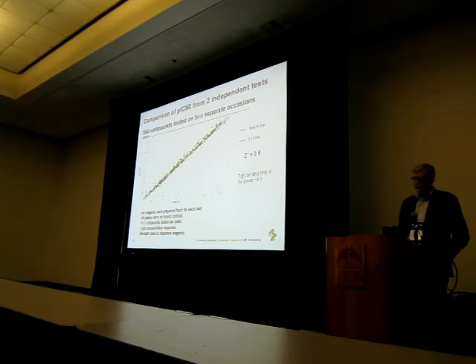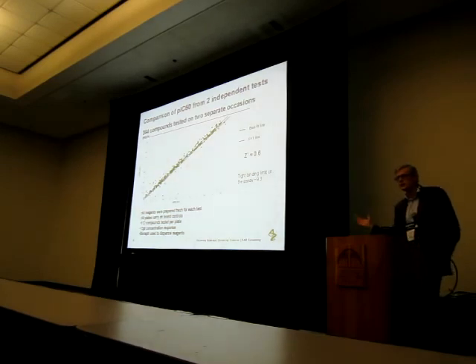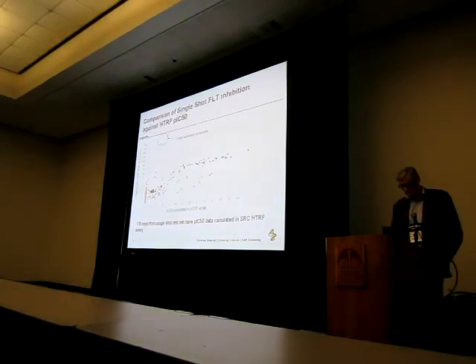So the Z prime for this assay, it's reasonable, it's okay. We've run biochemical assays in the past, and you can get better Z primes than the one we've got here. But we were reasonably happy with this format. So this is now looking at the 178 compounds that we had IC50 data for, and single shot data.